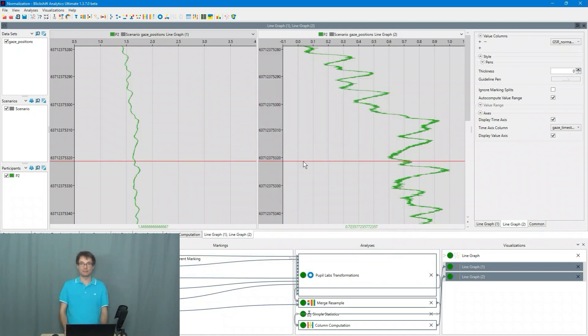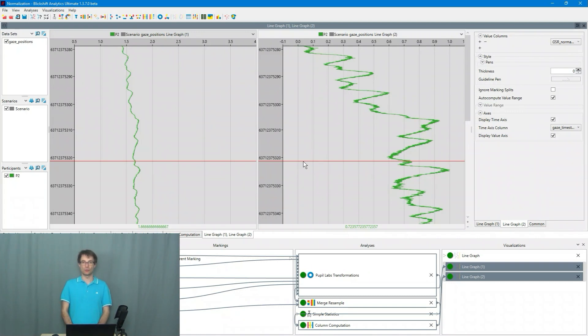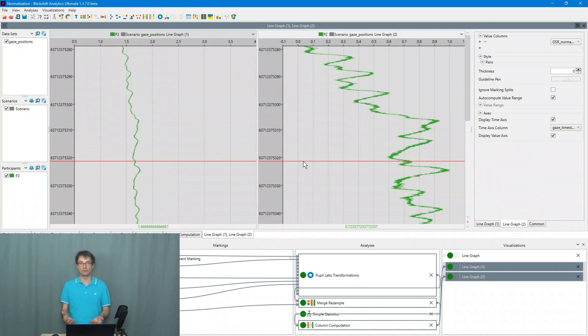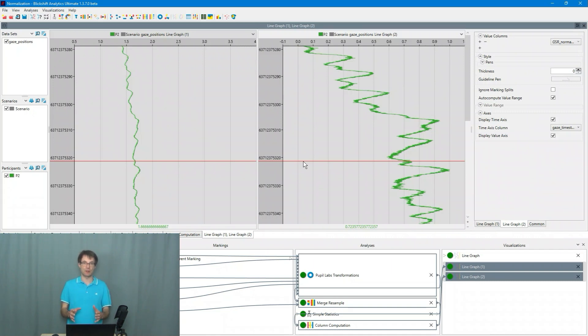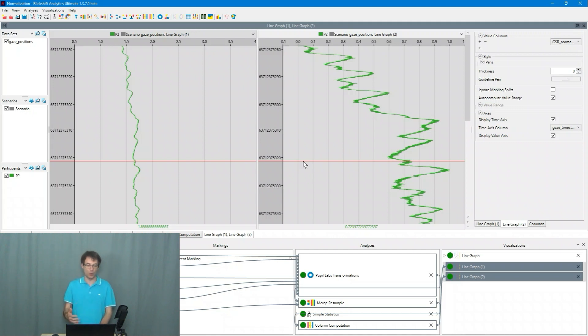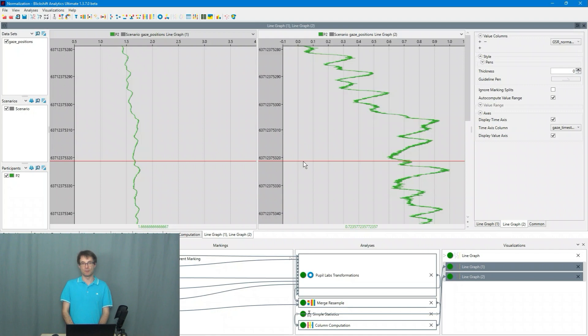Please have a look into this tutorial. There I show you what you can do for example with this normalized data. So you can search for it and can focus on specific sections in your experiment where you want to learn more about the eye movements based on for example a different range of the biometric values. Thank you very much for watching this tutorial.